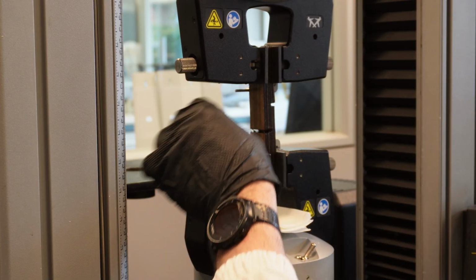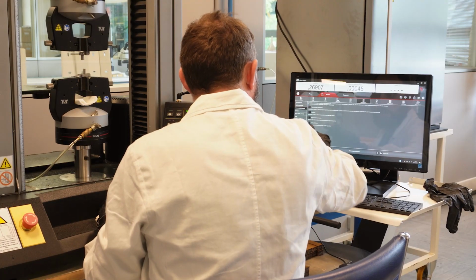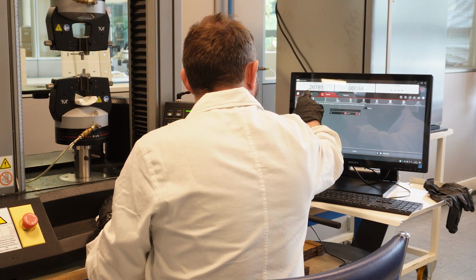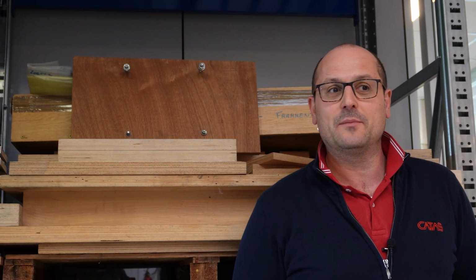Every day we basically break up what companies normally put together. Our game is to break down these materials and to see how they perform versus the rupture loads and how they break. And oftentimes how they break matters more than when they break. So this is basically the purpose of our tests. We measure how wood screws can hold in a board. We check whether the MDF fibers have been glued together properly, the quality of gluing processes. So there is a 360-degree assessment of the panel performance.